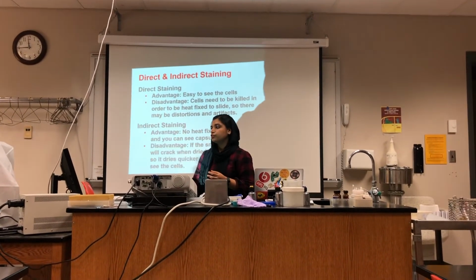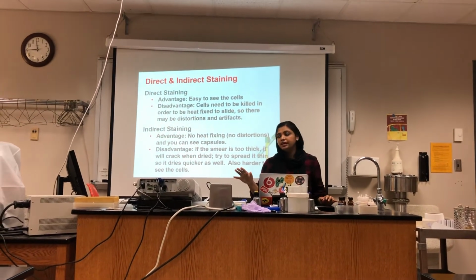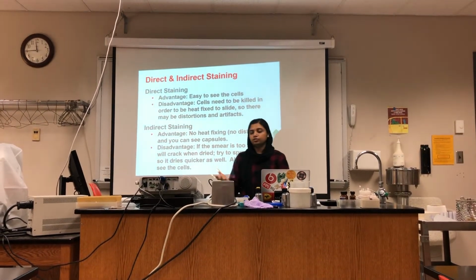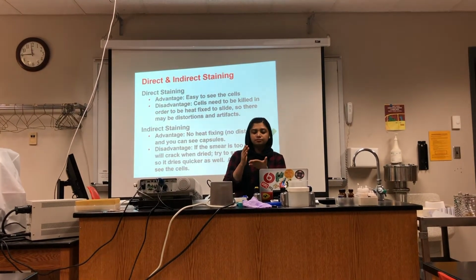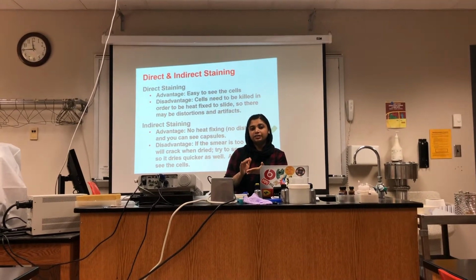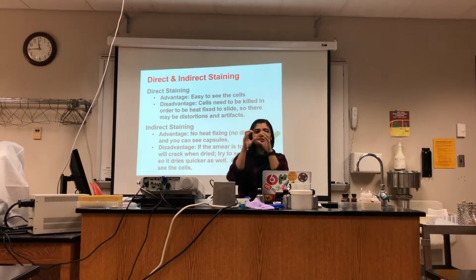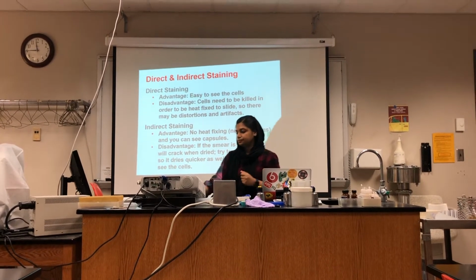In the case of indirect staining, the advantage is that there is no heat fixing, and so there is no distortion. The disadvantage is that we should make a smear that is very thin. If the smear is very thick, it may dry up, you could see cracks in between, and you would not be able to see the cells.